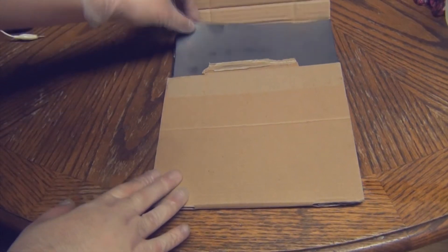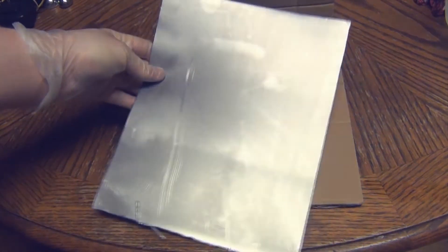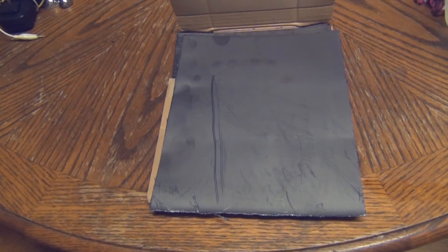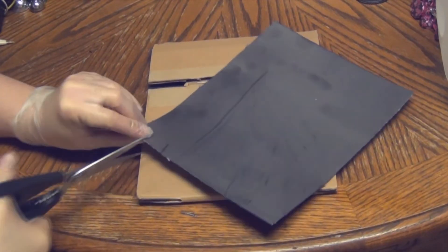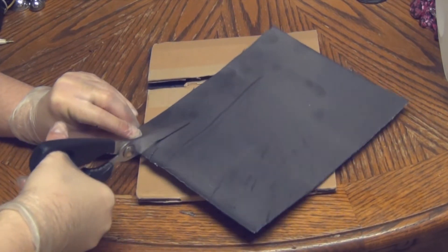First, you want to get your graphite foil and cut it. My graphite foil is pretty thick but you can use any thickness you want. Go ahead and cut it up — you can use any size you want.